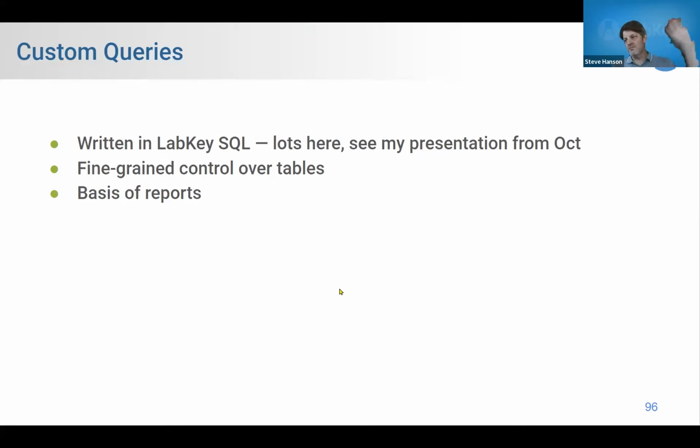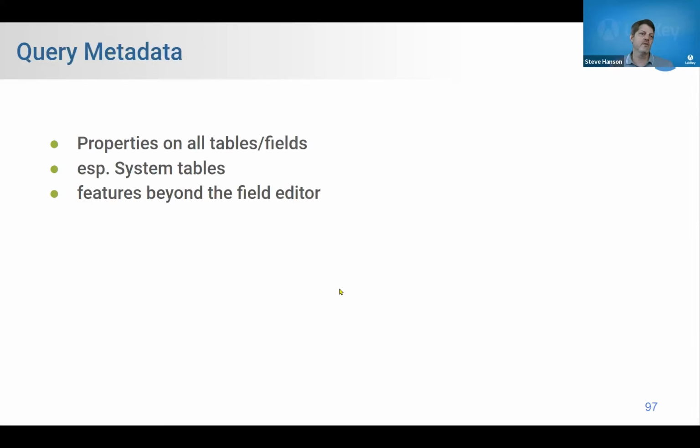So much you can do there. Watch my October presentation. Query metadata. These are properties that you can layer onto queries.